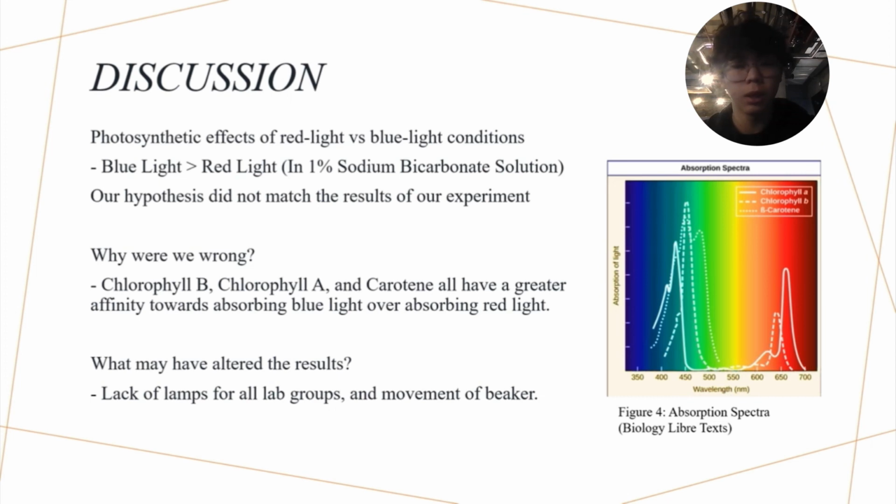Despite these sources of error, our experimental results were consistent with the absorption spectrograph. Our experiment concluded that the overall absorption of light by plants favors blue light over red light.